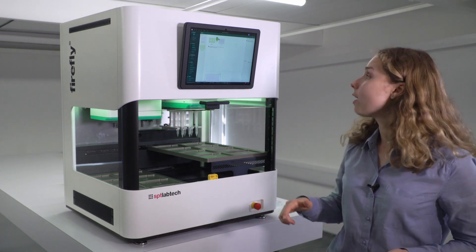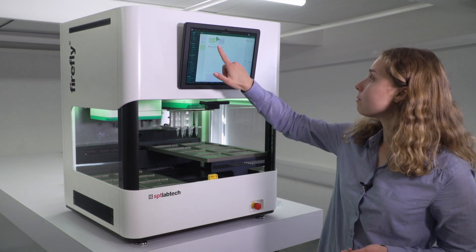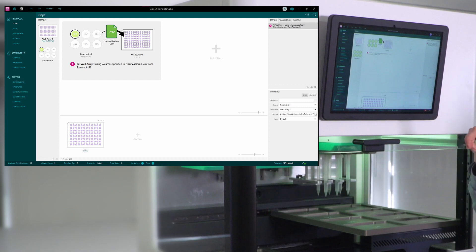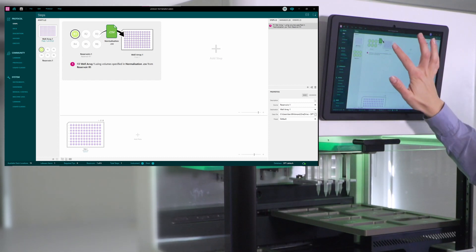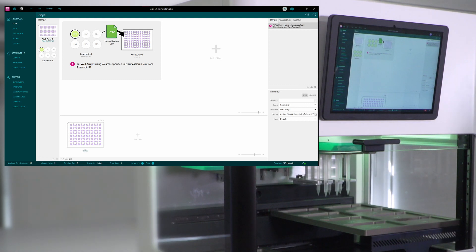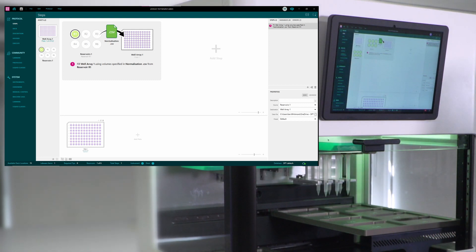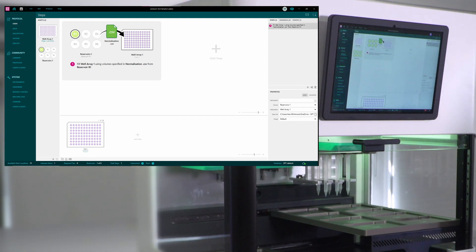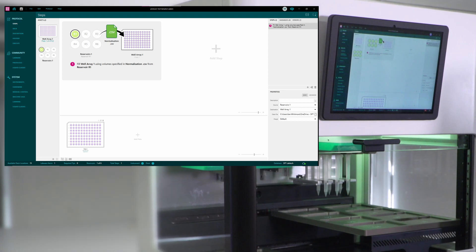To write this into a protocol on Firefly, there's a very handy step that is called a file fill. And in this step, the user can define what exact volumes will be added into each well of a plate with a dispensing head. In order to define it, we can create a CSV file. This can be created in Microsoft Excel.